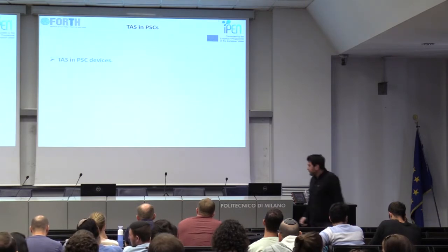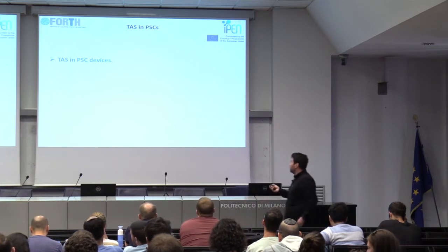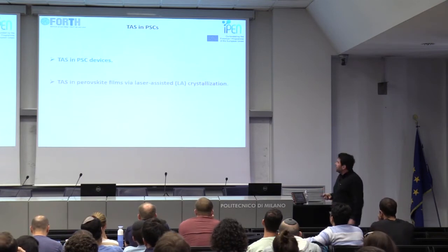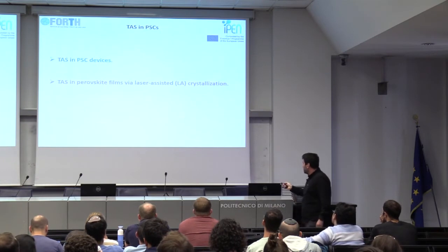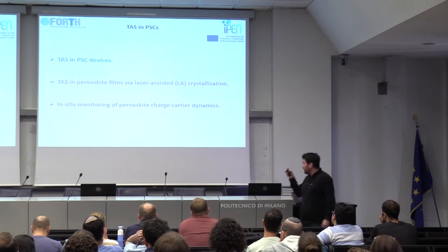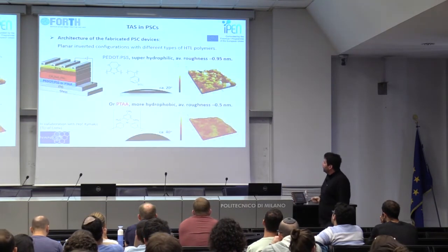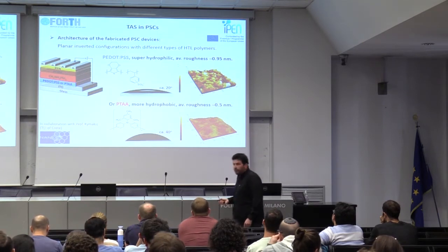Now, let us move on to the first set of results. So it will be TAS in perovskite solar cell devices. Then we will talk about how we implement TAS in laser-assisted crystallization, and then we'll see TAS during the crystallization itself.